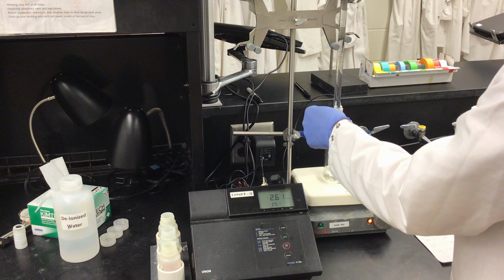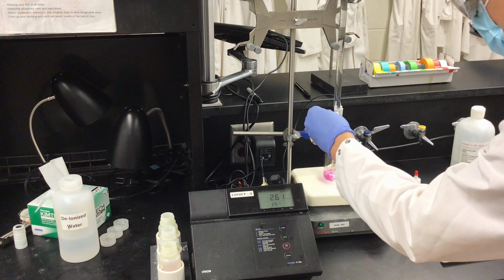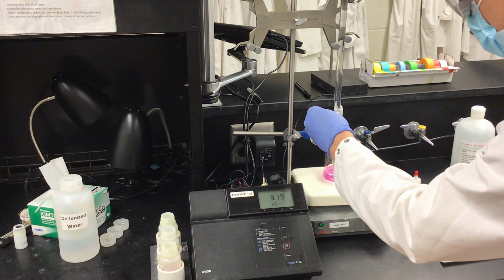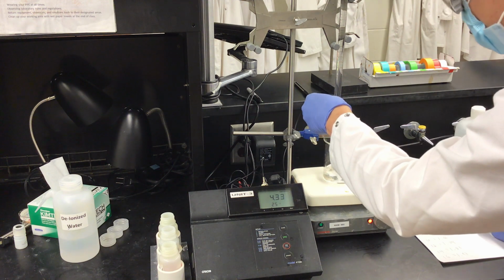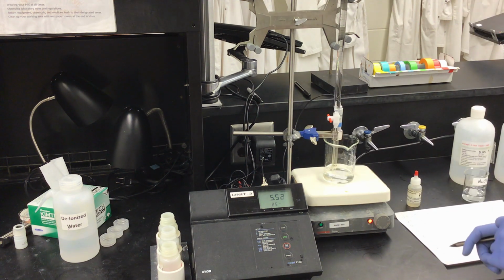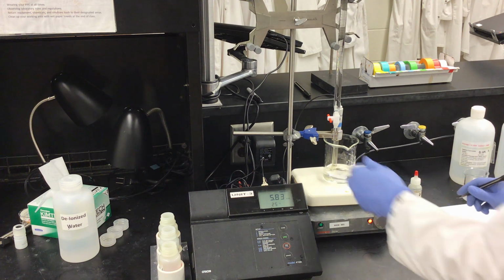So at 22 milliliters, we have a pH of 2.61. So I'm going to be careful now in this next one to make sure that I don't overshoot the endpoint. As you see, our indicator is staying for much longer. At 24 milliliters, we are at a pH above 5, which means we are very close to our pH of 7, our neutral, which is our endpoint of the solution. We have a pH of 5.83 at 24 milliliters.